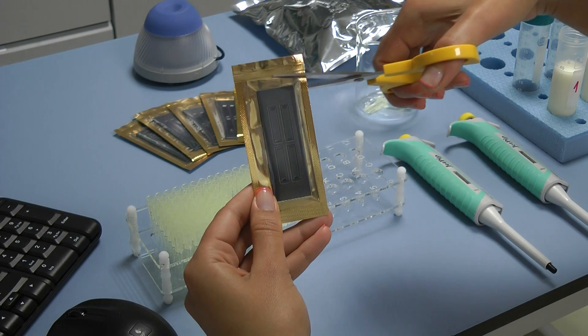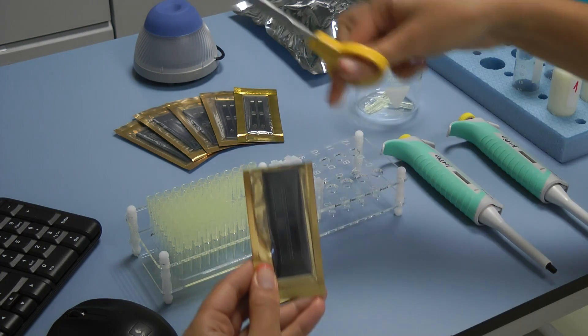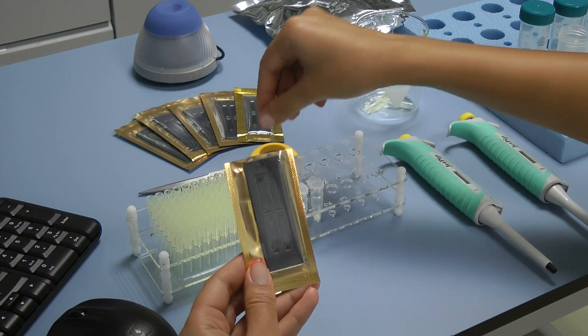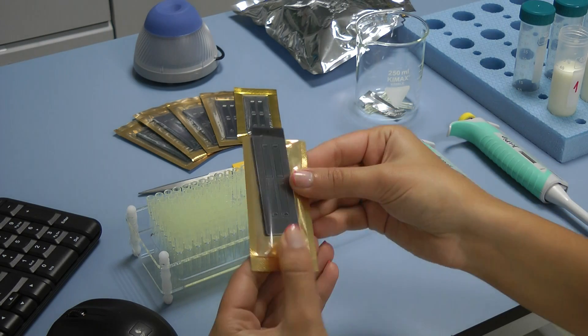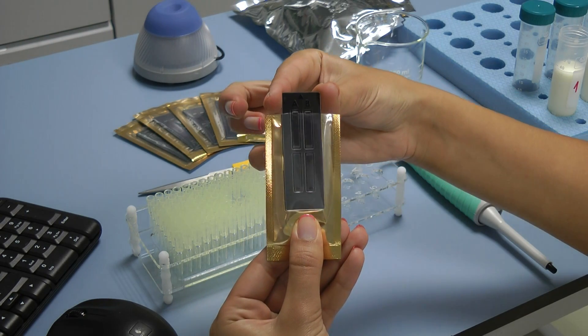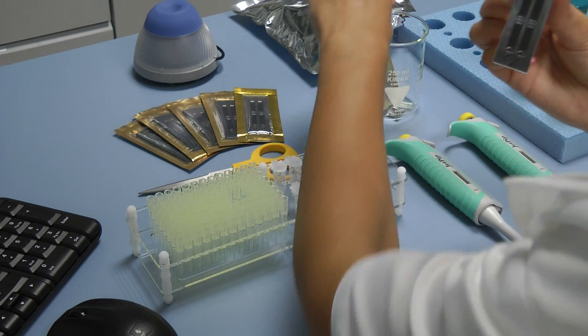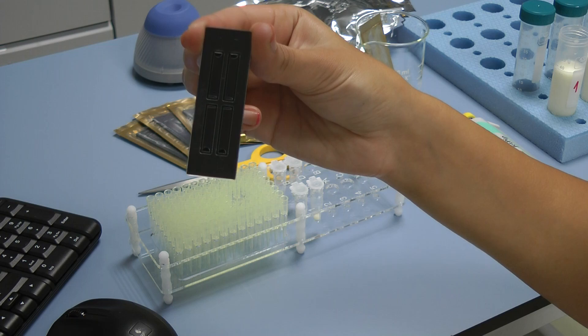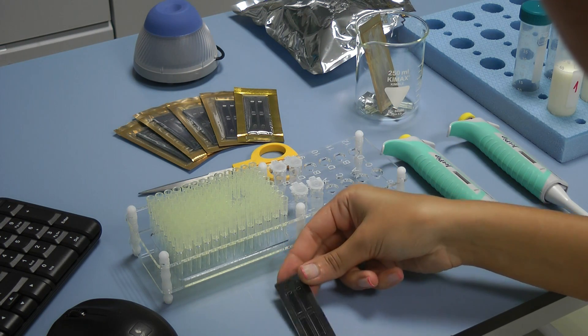Now it's time for pipetting the samples in the microfluidic camera of LactoChip. If your samples are 8 µL, you have to use LactoChip 4, and if it's 14 µL, you have to use LactoChip 2. Carefully take the microfluidic camera out of its package. Do not touch the upper surface of the LactoChip. Always hold its side edges.